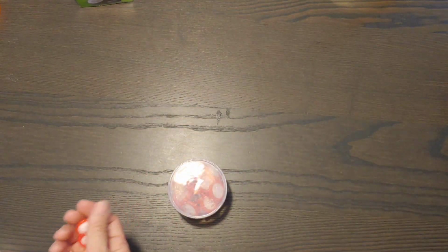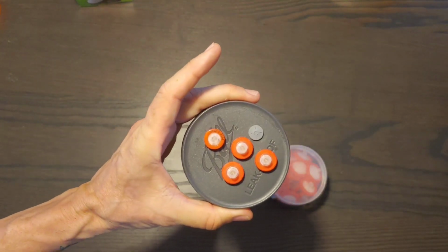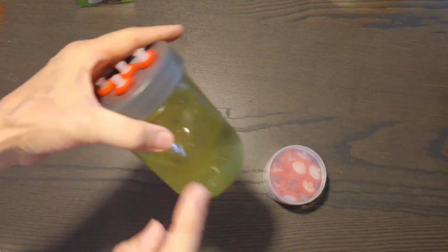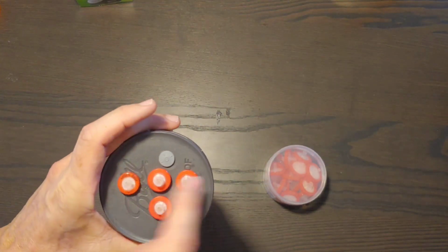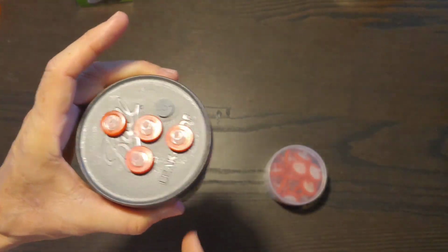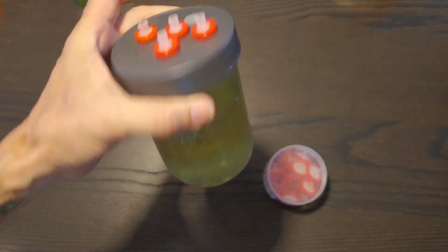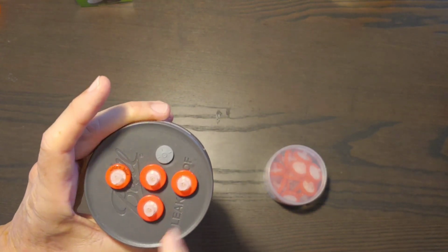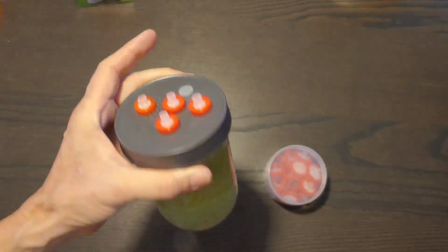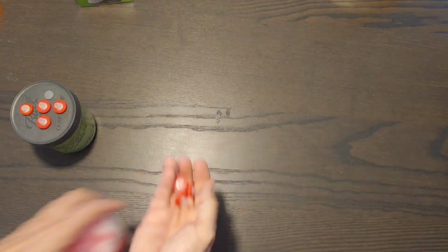One more thing is, you see on my videos that I have these 4 syringe filters, and you're like, why 4? Why not just 1? I found that especially when colonizing grain in these, the more air, FAE, fresh air exchange that I have, the better they colonize, even with liquid culture as well. So I started with 1, it was slow. I added a second one next time, then a third, then I said, you know what, I'm going to put 4. So I went from 1 to 2 to 4, and I found that with 4 it colonizes a lot quicker.